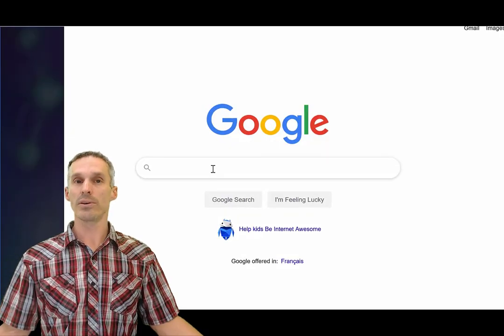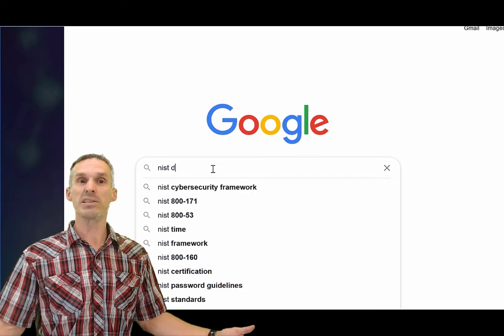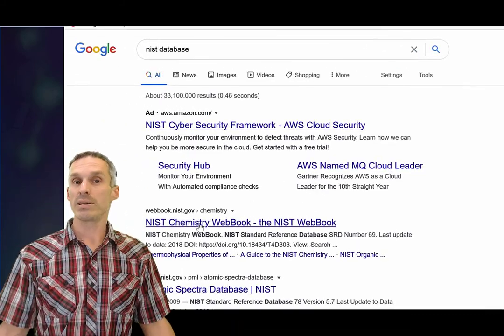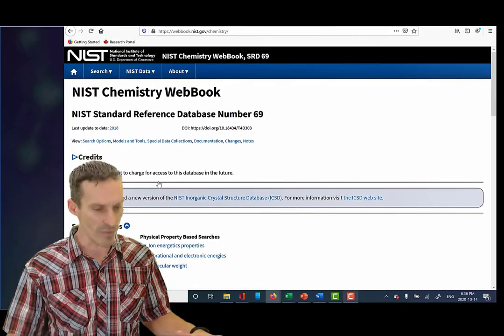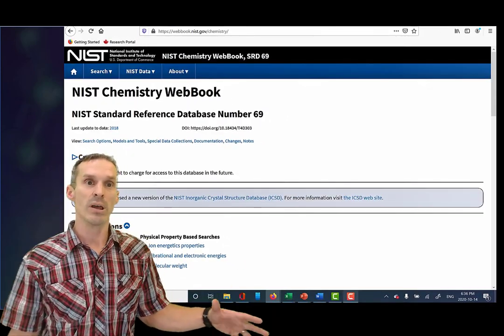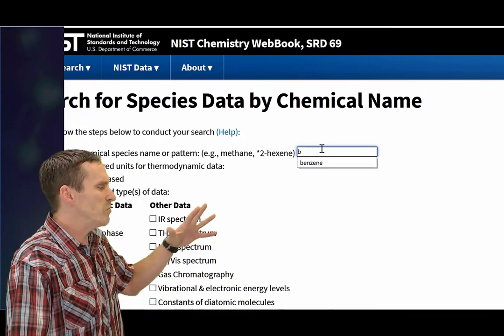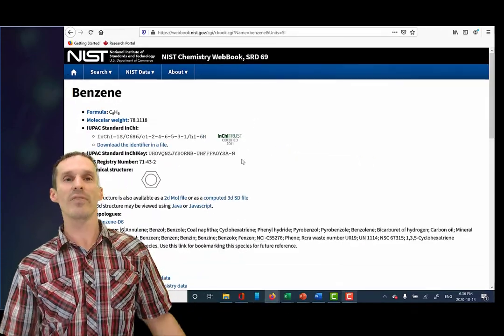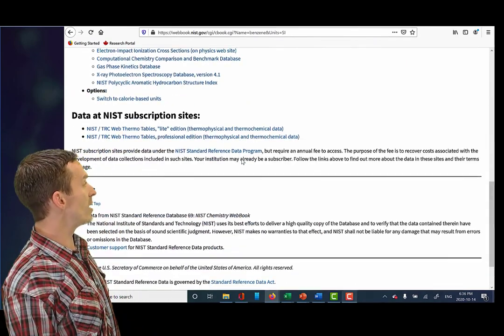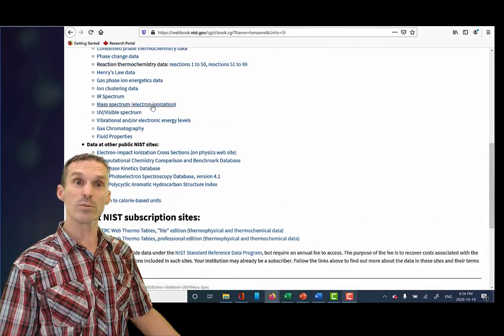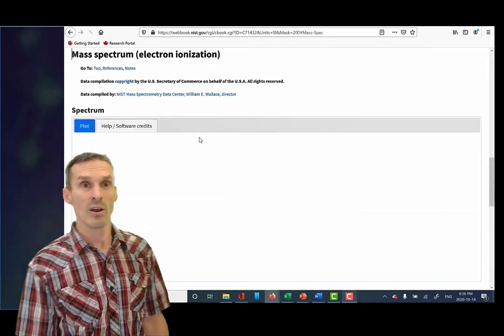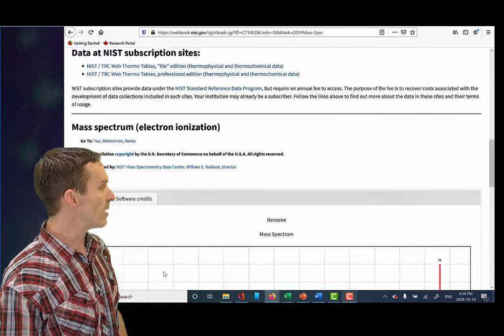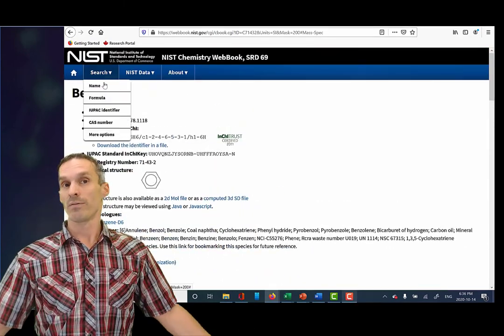I'll show you a useful tool here. You go online, you can type in the NIST database, the National Institute of Standard Technology. Basically, this is a depository of all things chemistry. You can get all kinds of information like the UV spectra, IR spectra, NMR, all this kind of stuff. You just type in your favorite molecule and you go hunting. Somewhere on that list, there should be mass spec data. When we look at this, we're looking at EI, electron ionization mass spec.